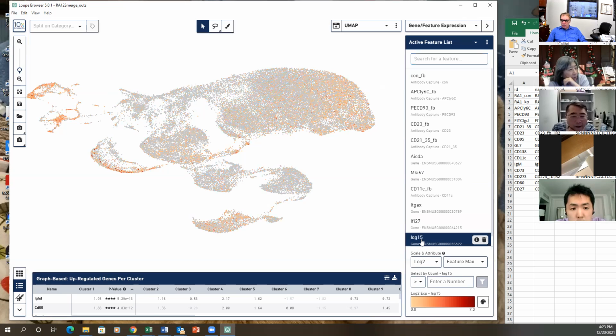There's some, but not a whole lot, right? At least more than 1,000, I guess. More than last time, more than 1,000 cells. In my case, it's only several cells. Yeah, that's why I said more than 1,000.